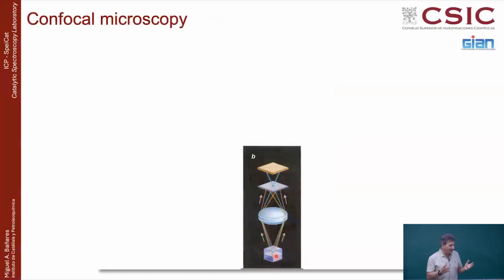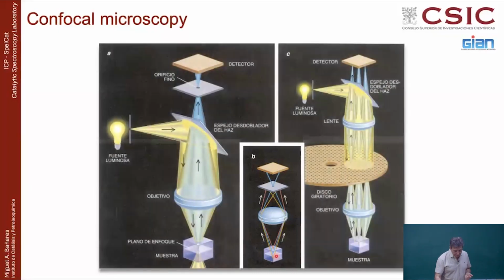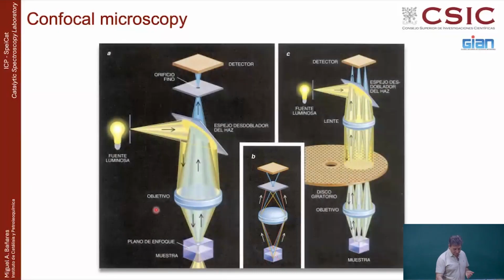And also the way this confocality works is that you can see through it at one point, but we are talking about maps. You can go point by point by point and generate what is happening at the given level. Experimentally, that will be time consuming. So people have come up with intelligent ideas.